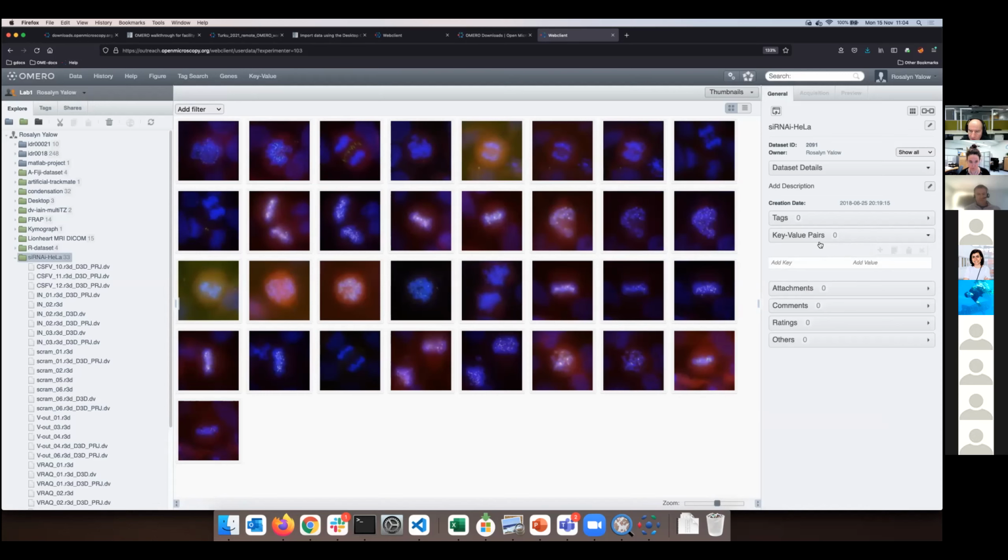We will need that for tomorrow when we work with QuPath and Fiji, and I will then highlight the other features, the annotation possibilities, and within the management, and then we can end today with Omero Parade. And tomorrow we will do Fiji and QuPath, mainly because that was something you were repeatedly asking for.